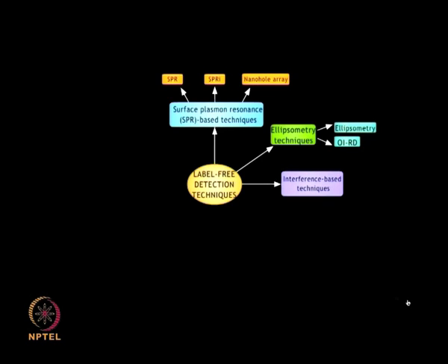Interference based techniques. The interferometry is based on the principle of transformation of phase difference of wavefronts into readily recordable intensity fluctuations known as interference fringes. The various detection strategies that make use of this principle include SRIB, AIR and BioCD.